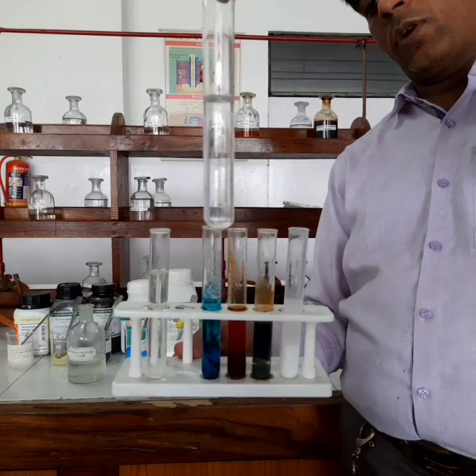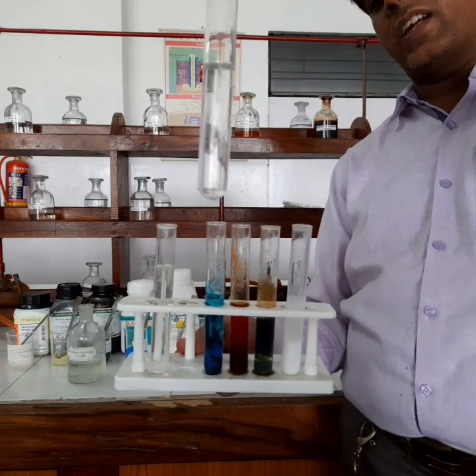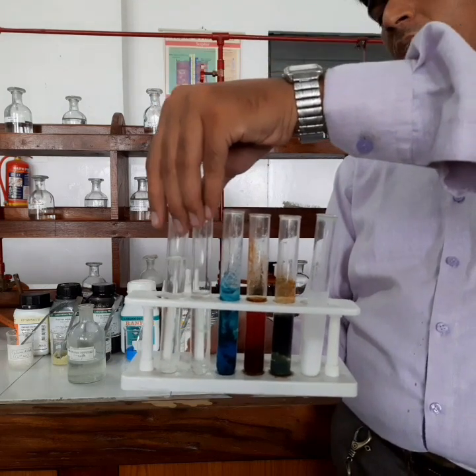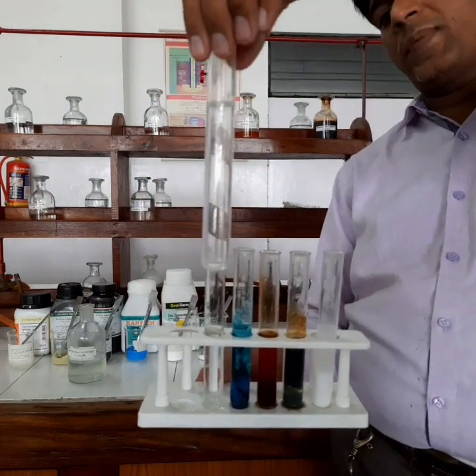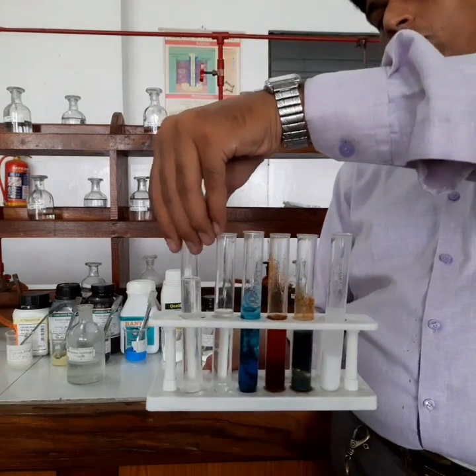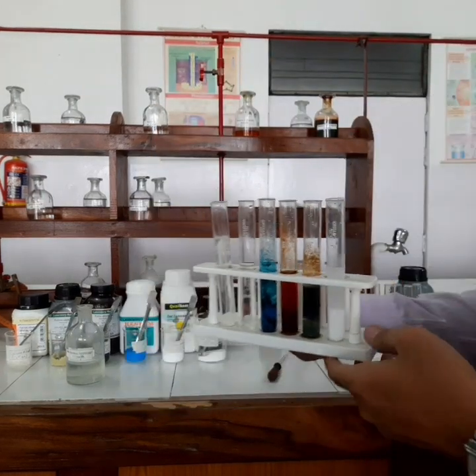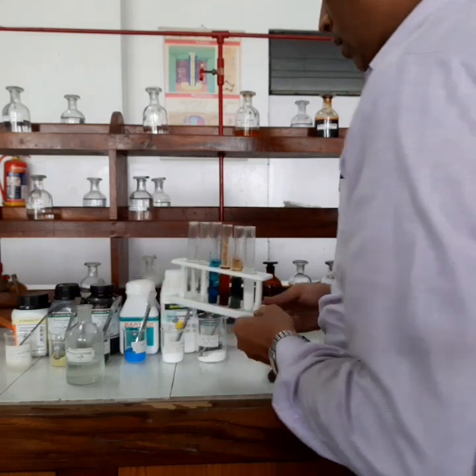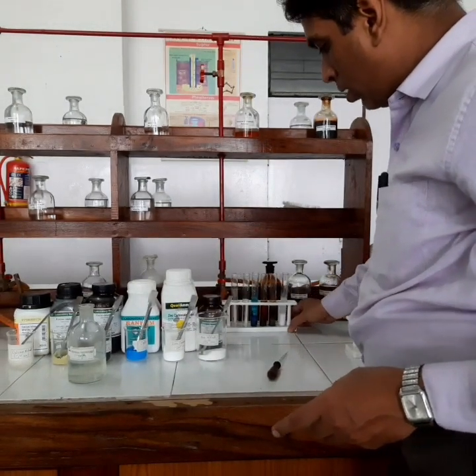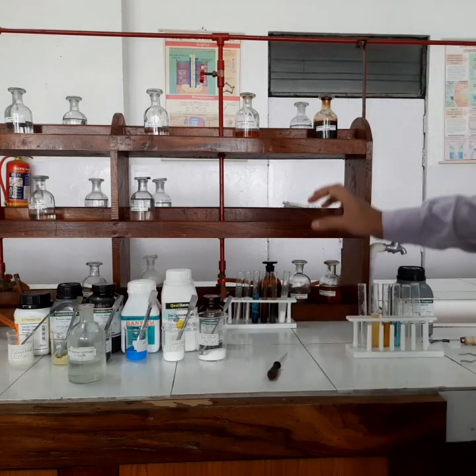Zinc had formed a gelatinous white precipitate, but that precipitate had dissolved in excess of NaOH because of the formation of sodium zincate. And lead had formed a chalky white precipitate that also had disappeared because of the formation of sodium plumbite. So this is all about the test with NaOH. Now we are going to perform our test with NH4OH on the same salts.